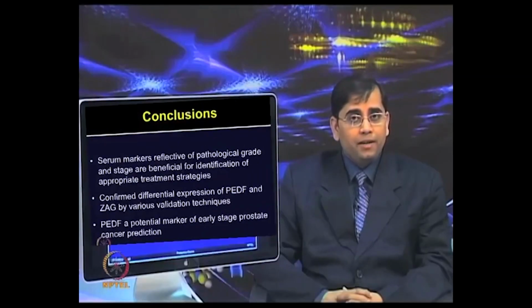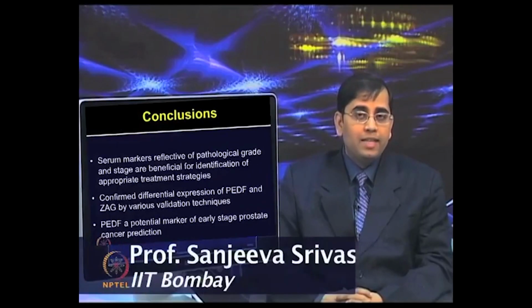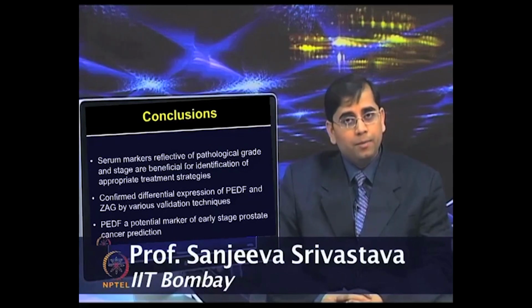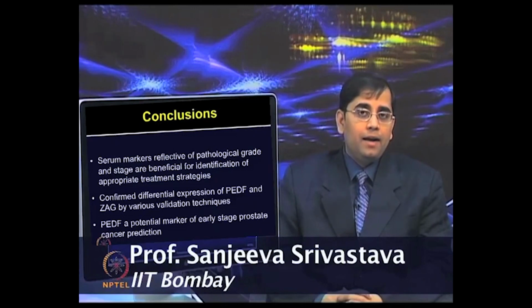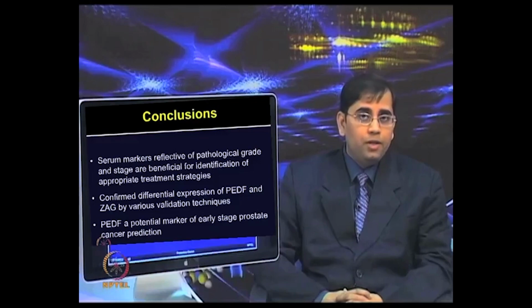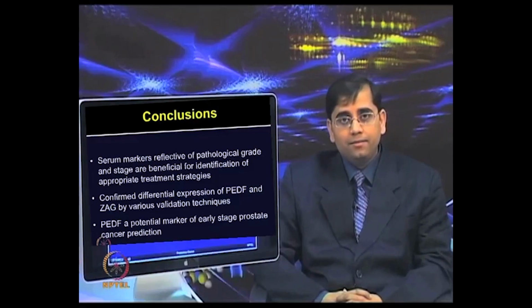You may appreciate that there is a lot of power in these techniques, and they can be employed for any biological application. You pick an application of your choice, and I am sure you will be able to address it by employing 2D or 2D-DIGE techniques. Thank you.